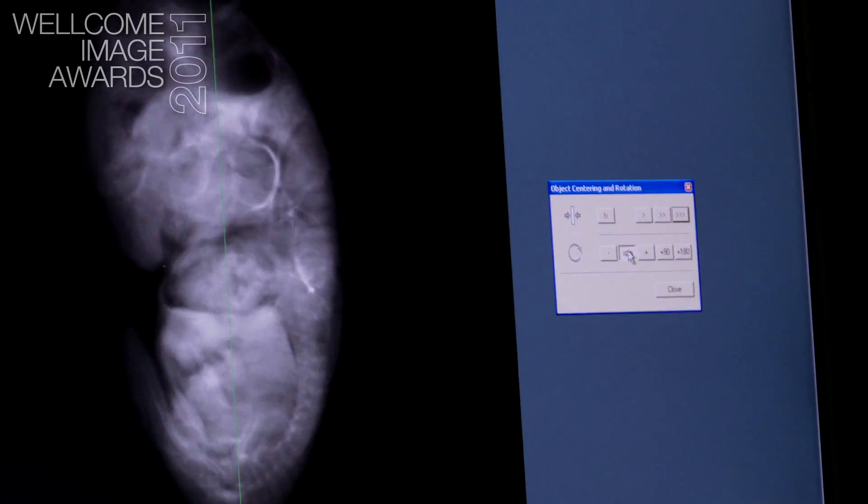The longest axis of the sample will be lying along the axis of rotation. This is the most optimal way to get good information out of the sample.